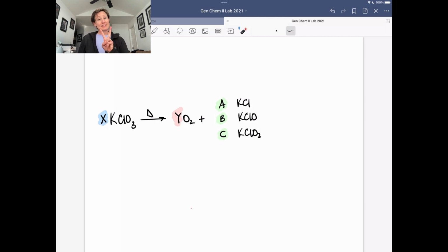So our next lab is a 2-week lab. First part of the lab is just going to be on experimental acquisition of data. The second part of the lab is actually going to be fully devoted to calculations. So one of the labs that we're doing here is like a lot of the labs that we do, which is we're looking at a chemical reaction and maybe we don't know something specific that's happening to it.